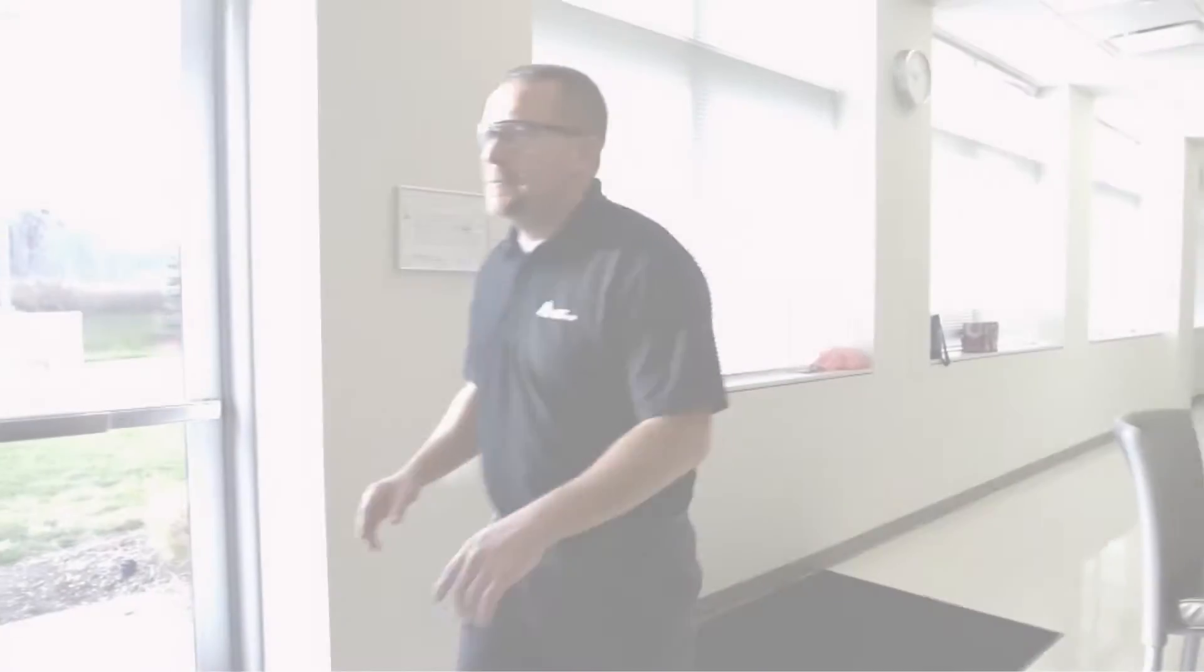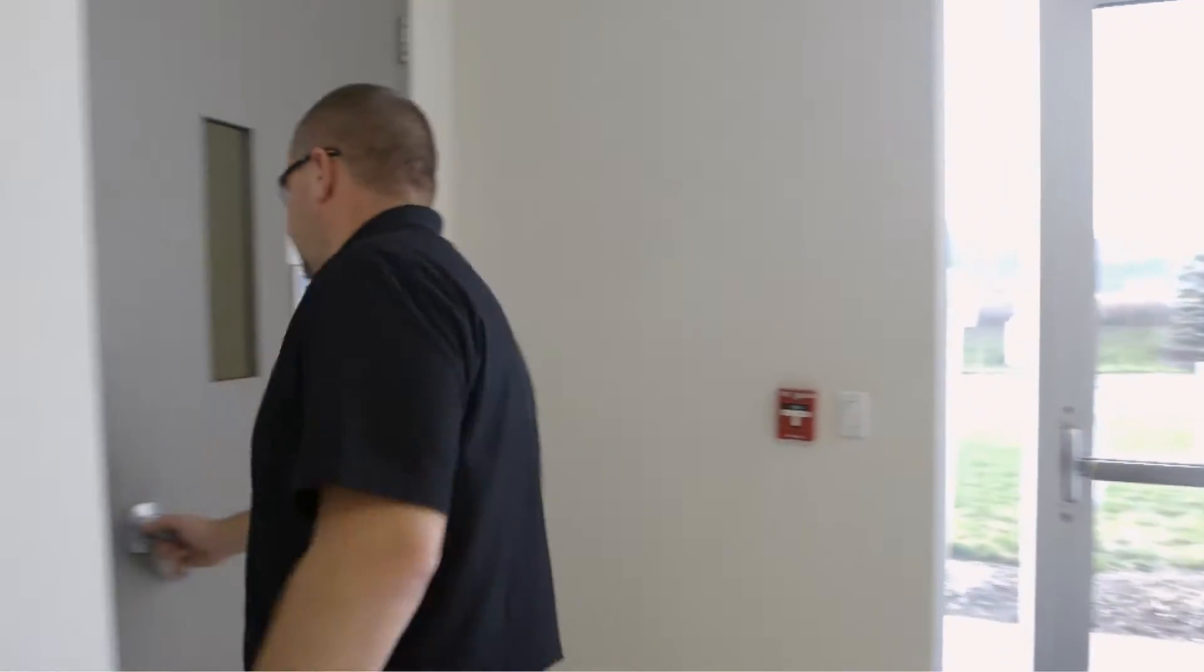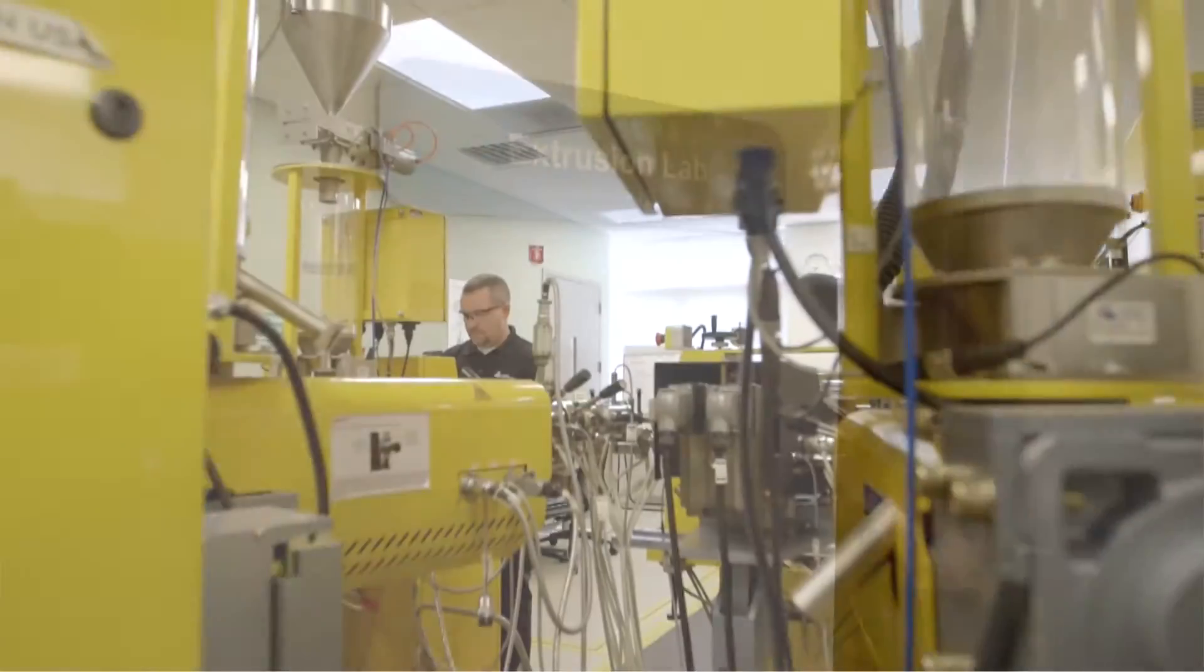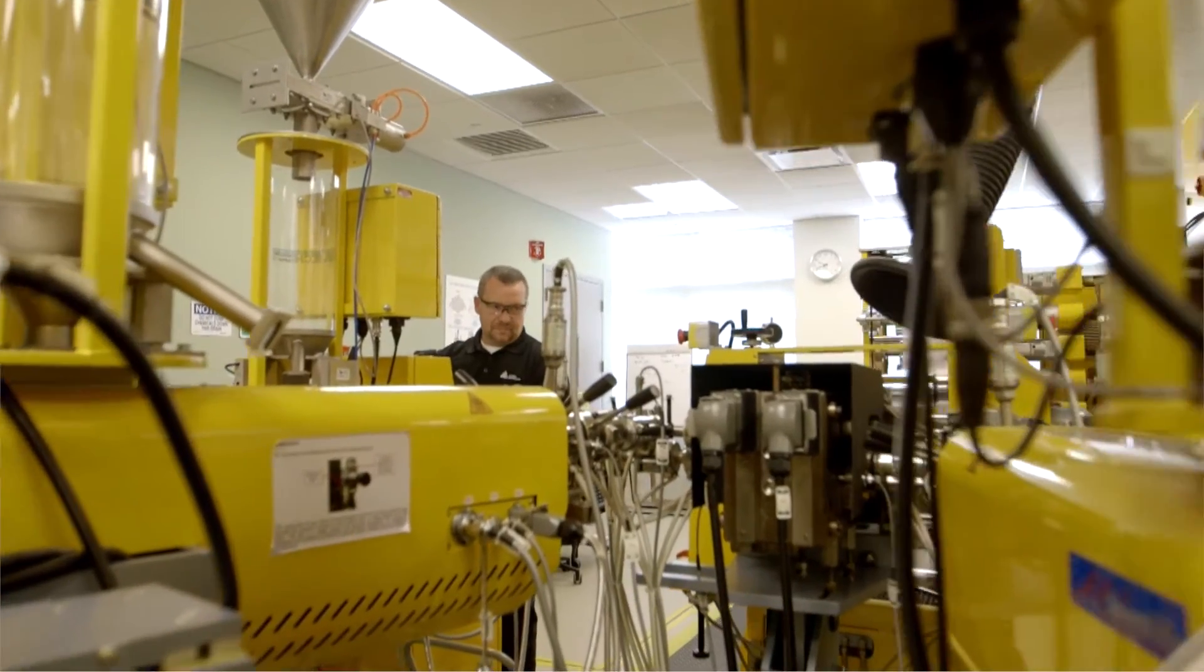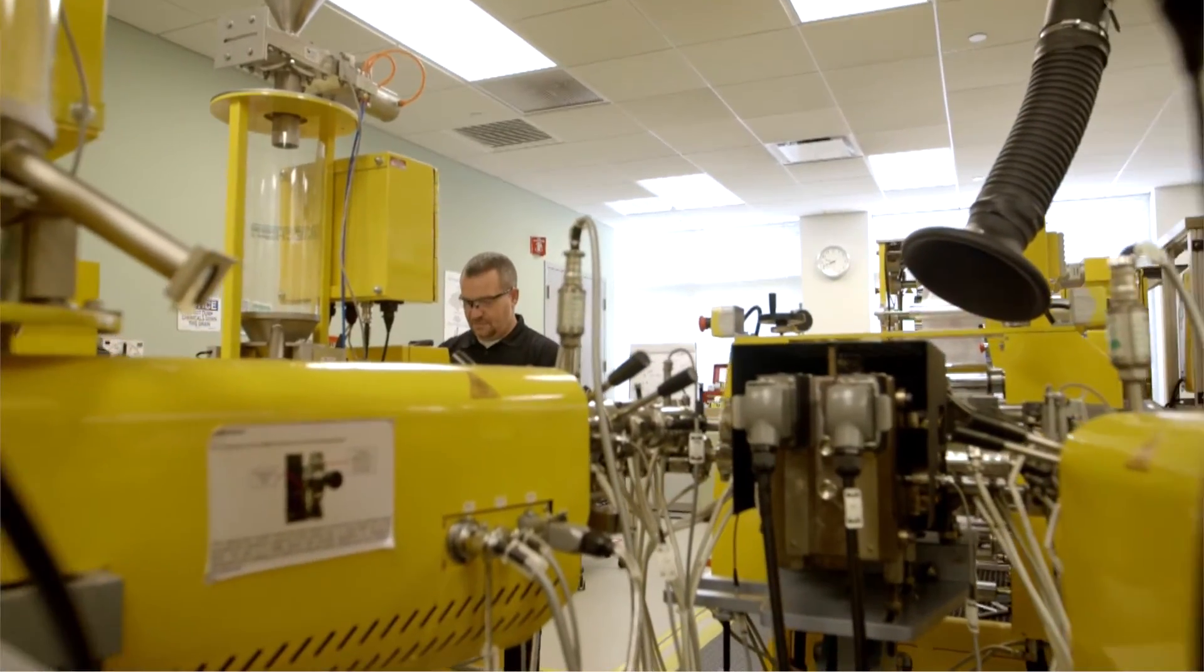The extrusion lab allows us to develop prototype-sized cast and blown films. In this area, we can test physical properties, troubleshoot, and turn resin pellets into film.